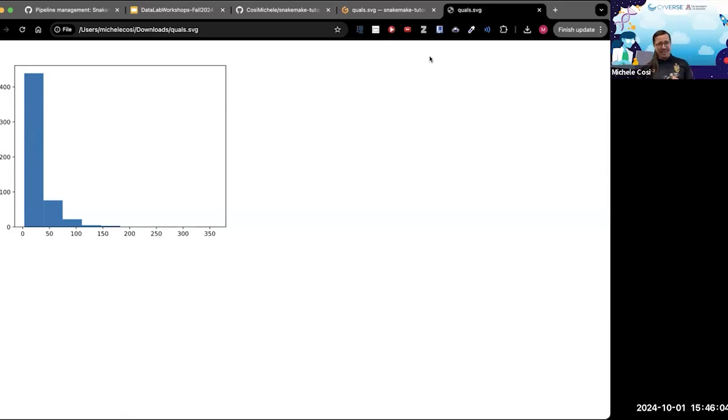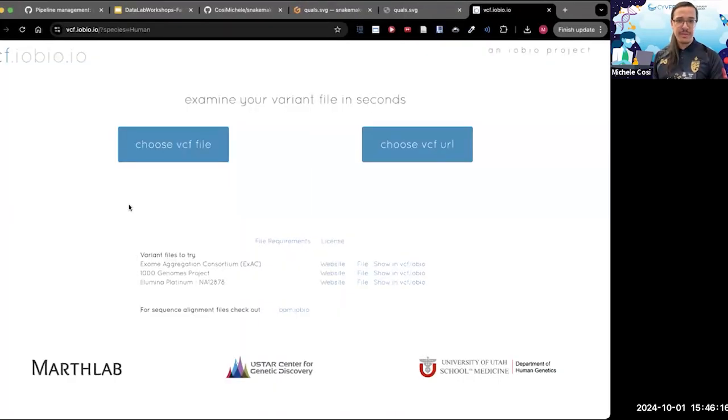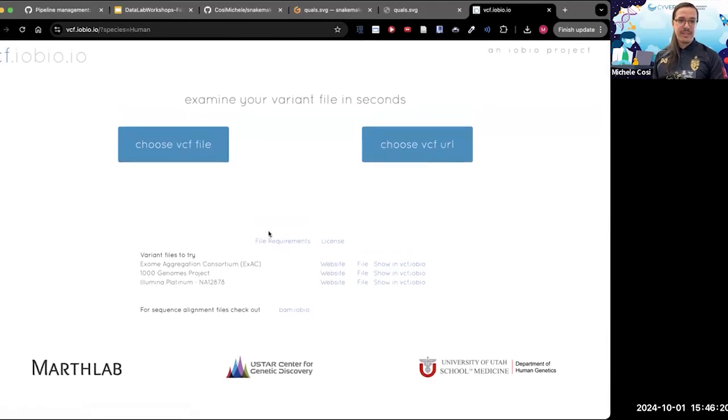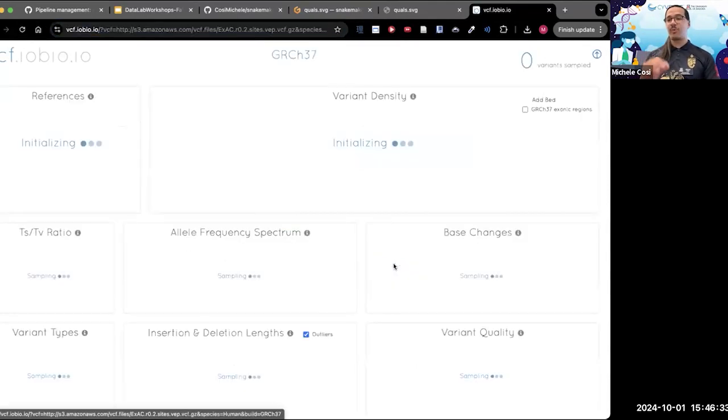The best thing I can connect this to is something called VCF. I probably should let you see this as well. I shared it in the chat, and this is a cute website that tells you a little bit about VCF files and what they are.